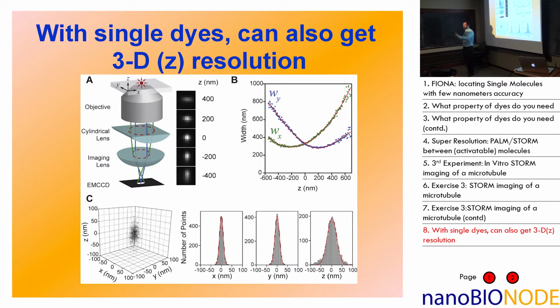Now, this is truly my last point. Over here, you can fit this to 8 by 8, and you have a certain amount of dark noise due to the EMCCD. In this case it's like 8, but in fact it may be over like 32 nanometers or 30 nanometers.